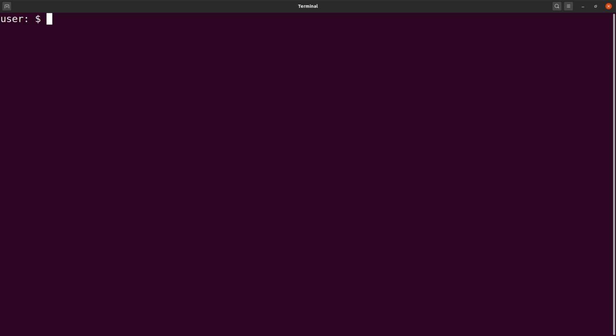You can also do that in Linux. We are going to use grep to do this. grep allows you to search for patterns in text and also search for patterns in text that are stored or saved in text files. So you can do that as well. There are other ways to do it, but I'll use the grep utility for now.